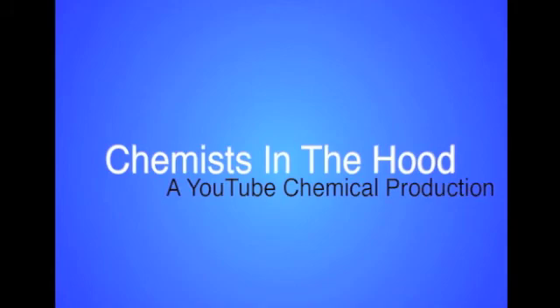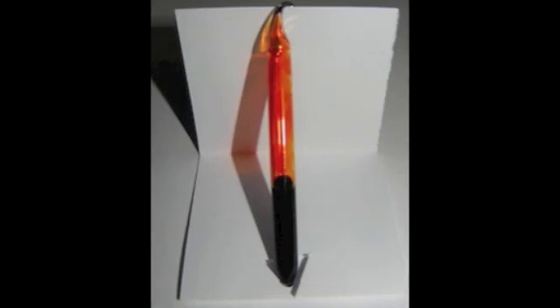Hello and welcome to Chemists in the Hood. Today we're going to be synthesizing elemental bromine. This is an advanced procedure and will require all glass distillation apparatus.